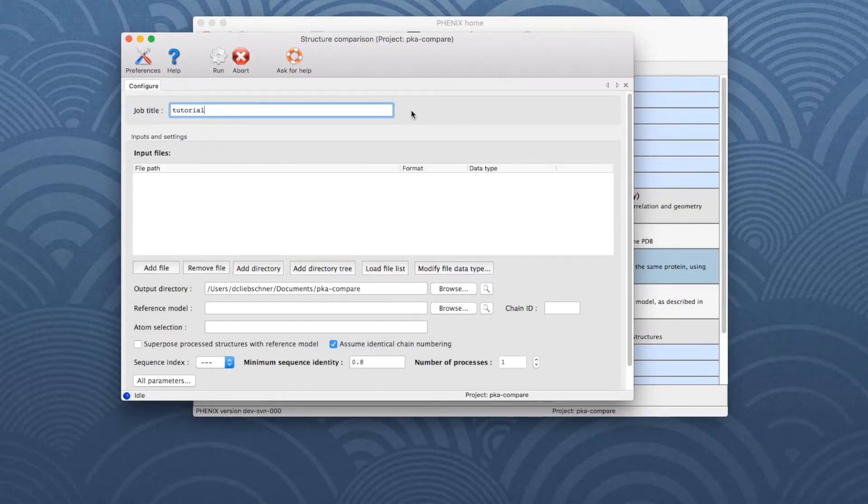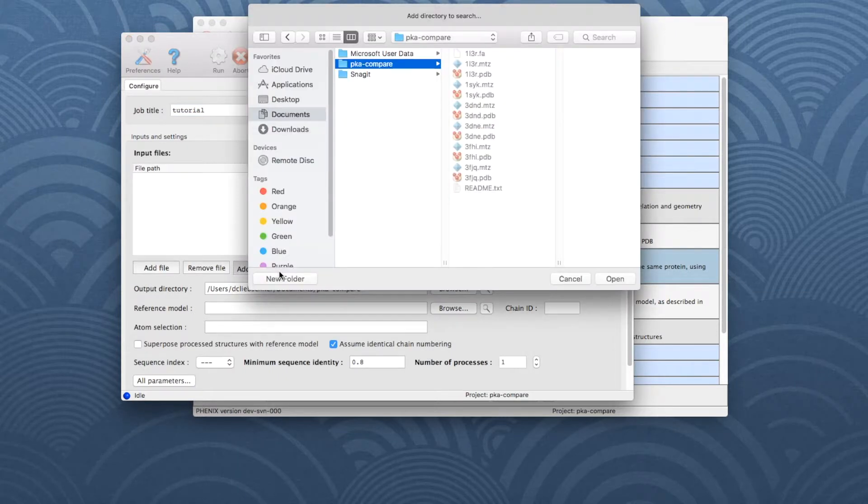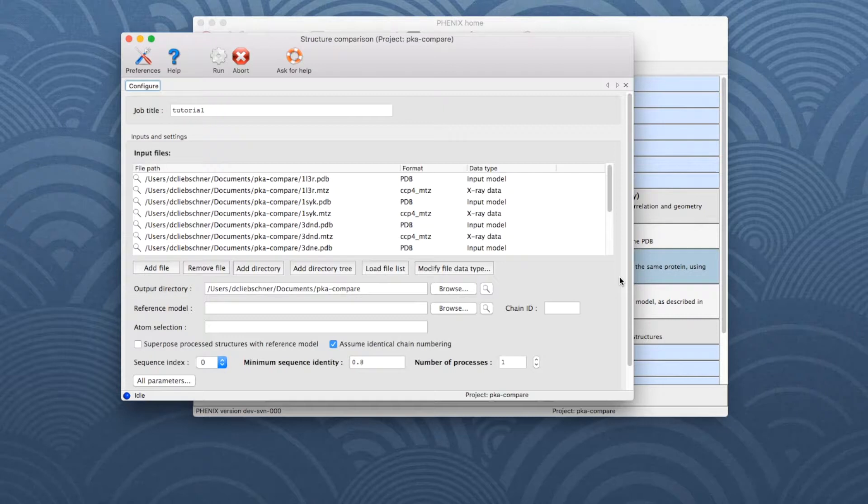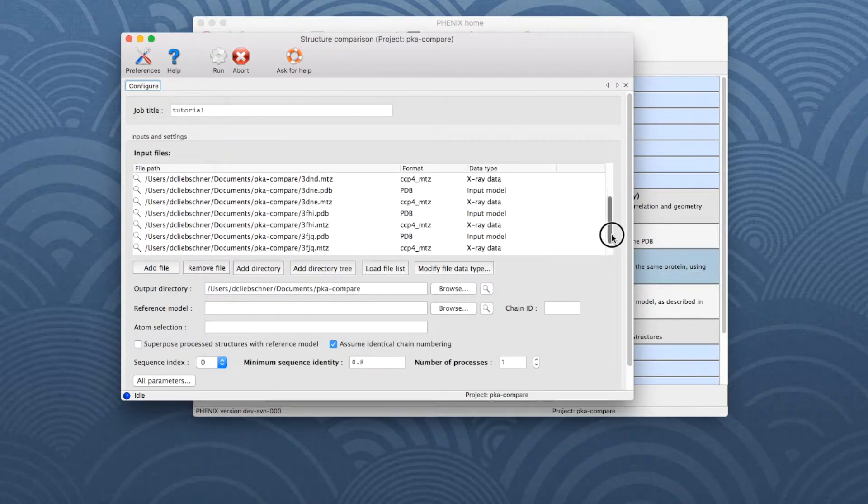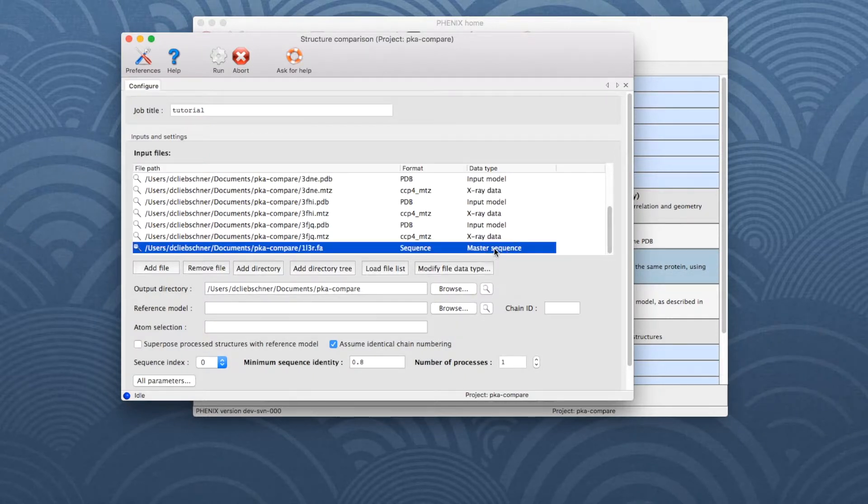As there are many files in the tutorial directory, let's choose Add Directory. The directory contains six model files, which are now listed in the input file window, along with the corresponding data files. The sequence file, which is at the bottom, is used to define the reference chain.